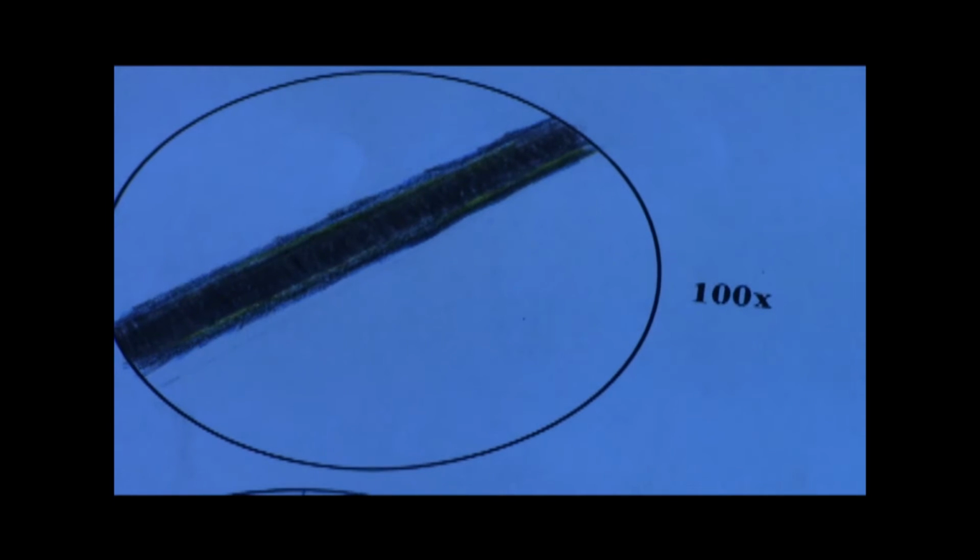The first circle is the 100x circle. This is for the yellow objective lens. When filling this one out, go to the yellow objective lens and draw what you see. This next circle is 400x. This is for the blue objective lens. This third circle is for the cast. When filling this one out, you do the same as the previous 2 and draw down what you see.